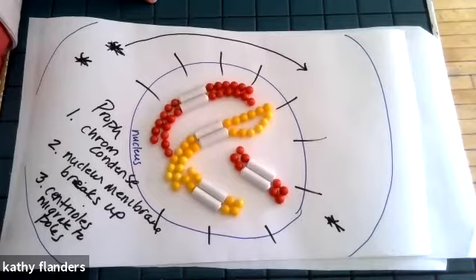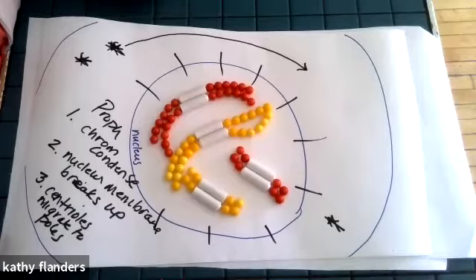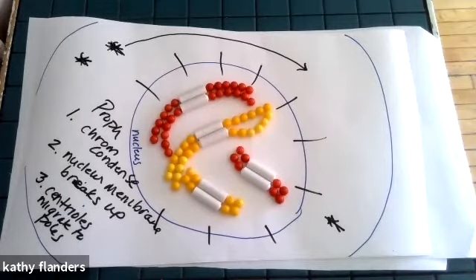Every prophase is going to have that happen, whether it be prophase of mitosis, prophase 1 of meiosis, or prophase 2 of meiosis. Okay, everybody with me?